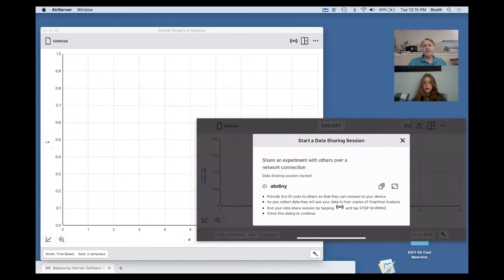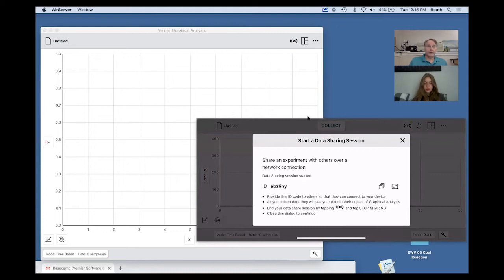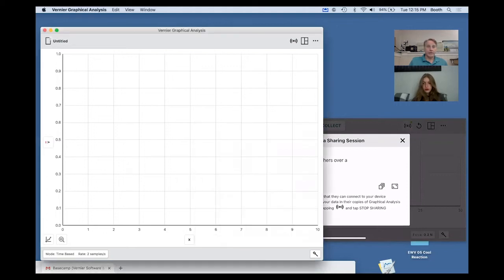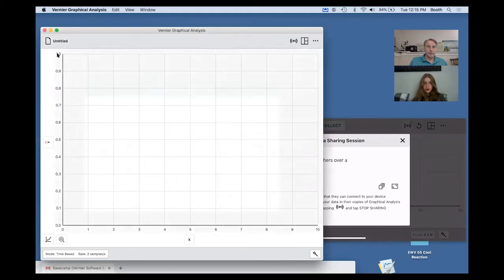That ID code is what a student would type into Graphical Analysis Pro to be able to do the data sharing. So I'm going to come up here where it says untitled, click there, and say new experiment.